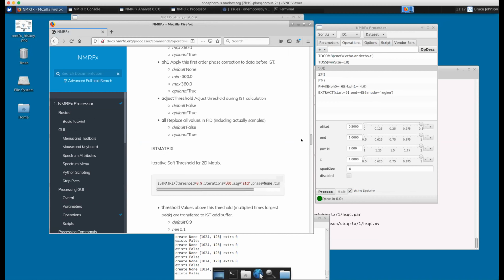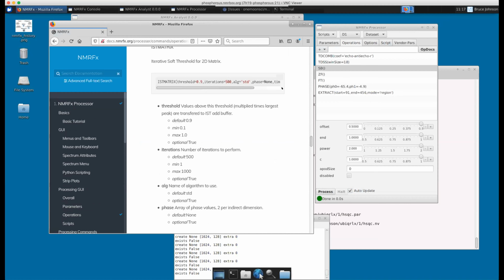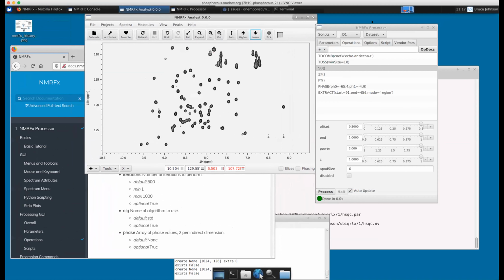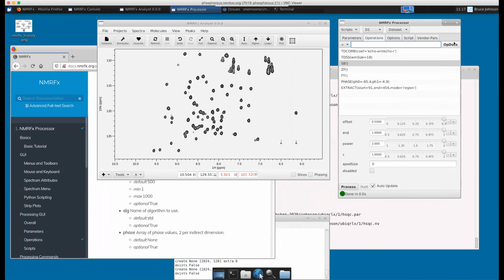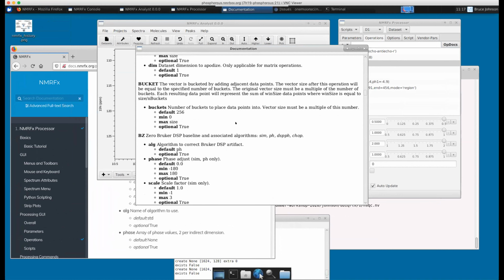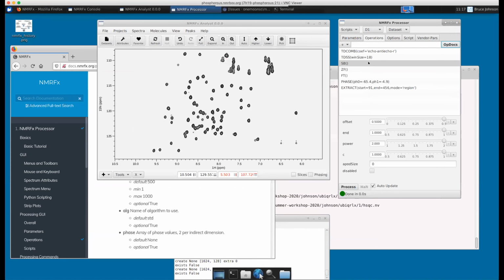To force us to actually write documentation, the program won't build the documentation for the operations, which comes out of the actual low-level Python code, unless you have everything properly documented in there to some extent. But you can also see just the operation docs right here inside the program, scroll through. So they're documented there. Let's walk down a few of them.